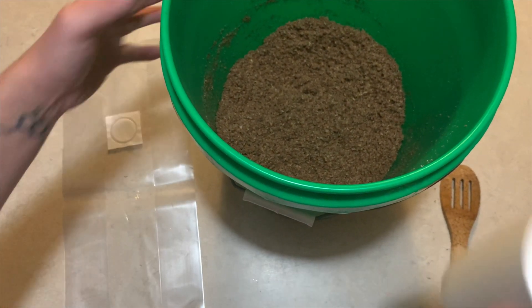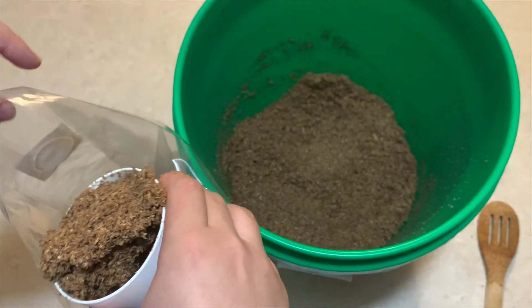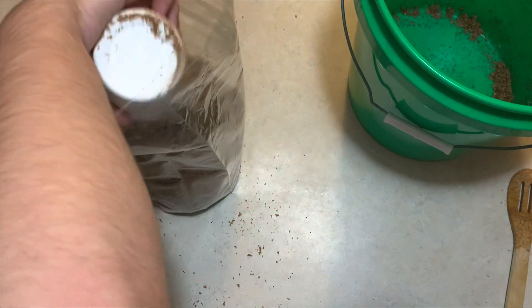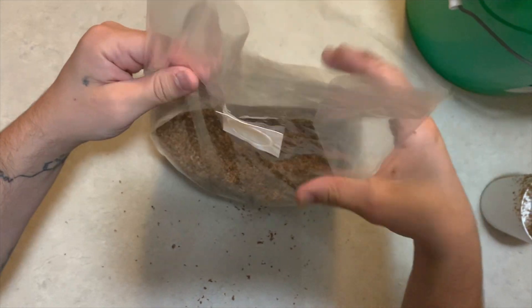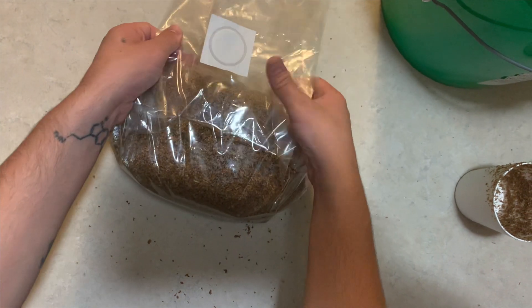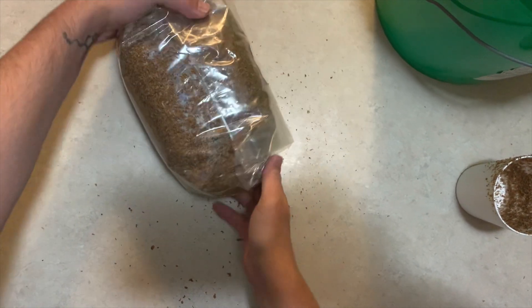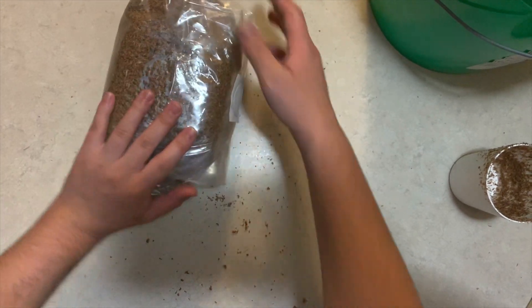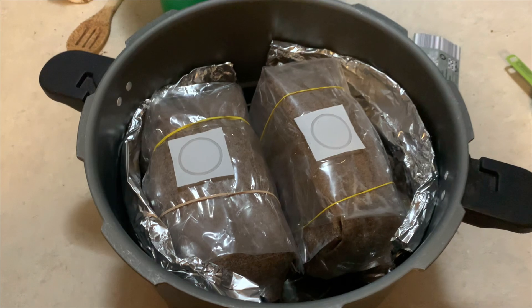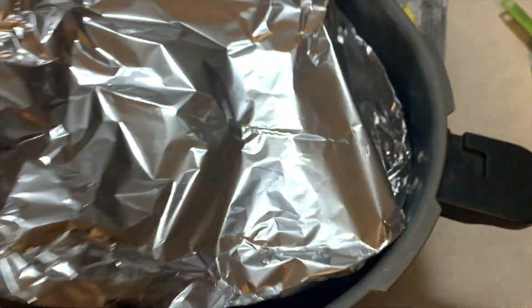The next step is to add your substrate to a filter patch bag made for growing mushrooms. Once you're done filling your substrate bags, fold them up and then pressure cook at 15 psi for two and a half hours.